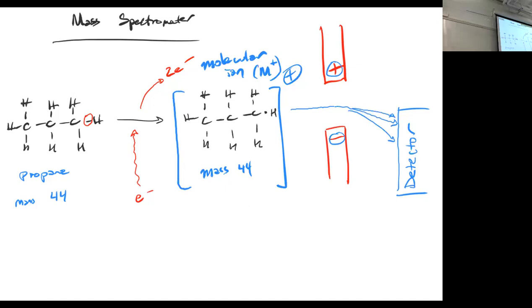So what's different between all of those? Why is it that you can affect some and not others? Yeah, the mass. A mass dramatically impacts how much inertia there is, and so how easy or hard it is to change their trajectory. The mass of the molecule, or the ion in this case, is going to impact primarily how much that path bends, and therefore where it impacts the detector.